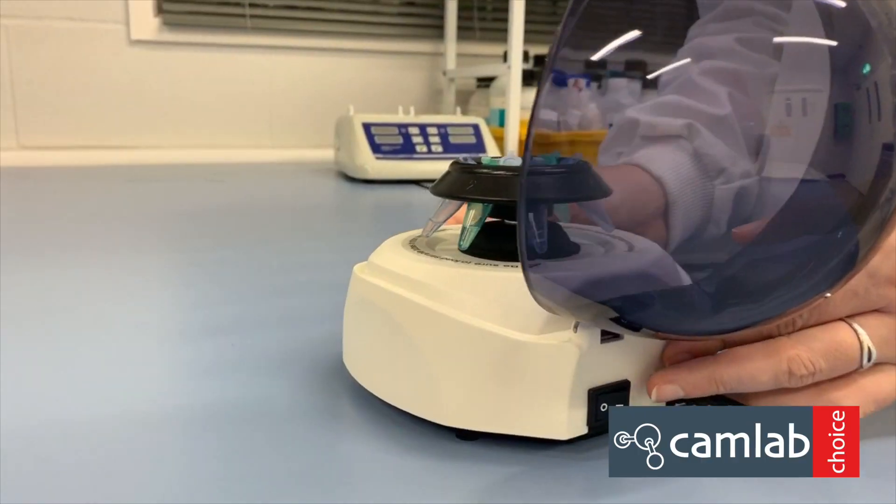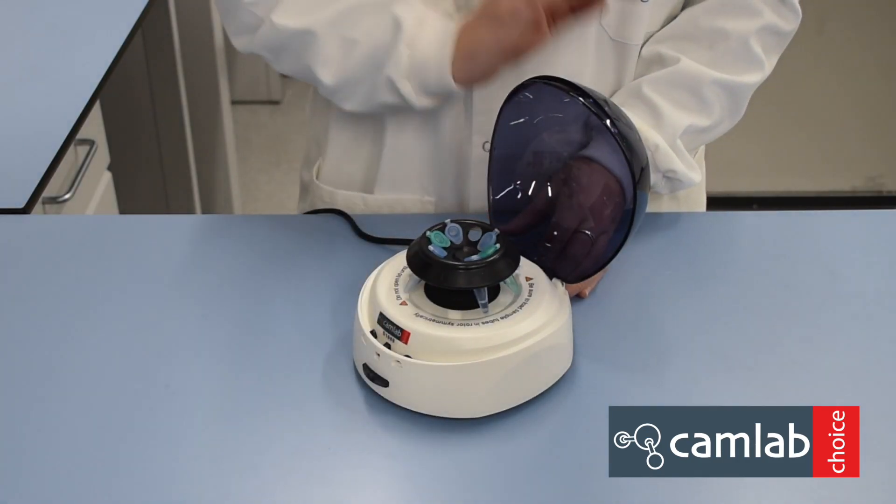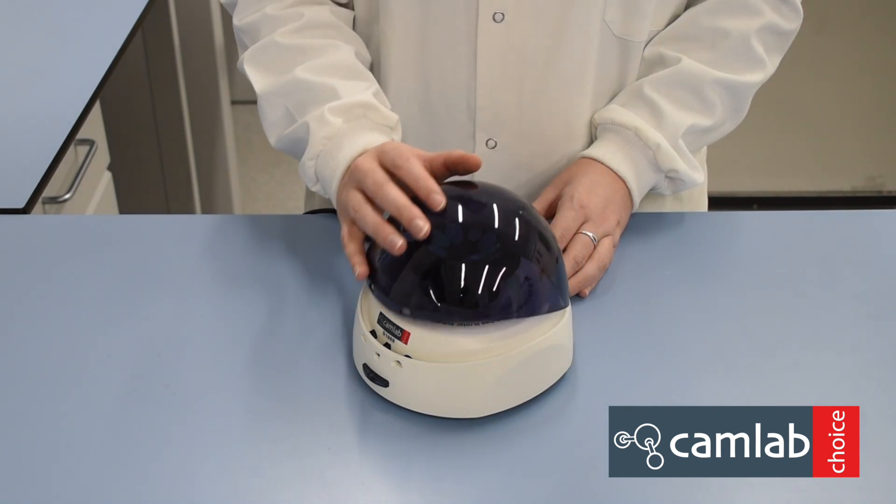Turn the centrifuge on at the back of the unit, and then close the lid to begin running.